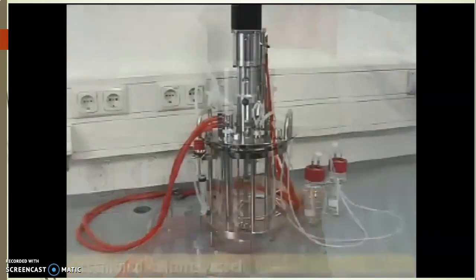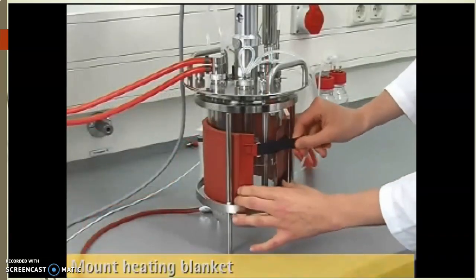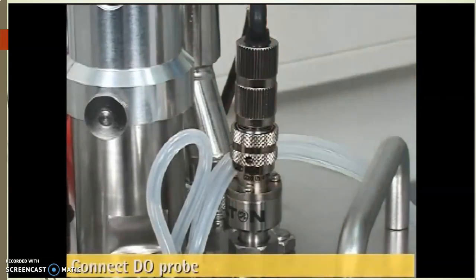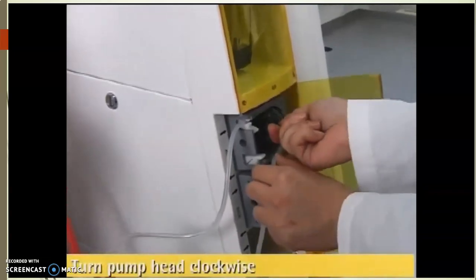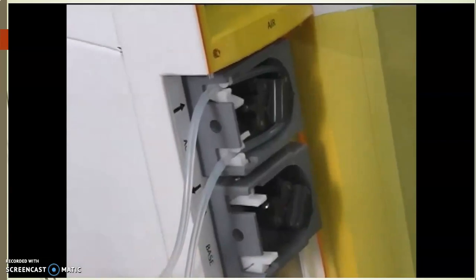Now installing the agitation motor, then this is the culture, then the heating blanket. After this the pH probe is getting connected, DO probe is also getting connected. Now the tubings to the motors are being set. It should be set clockwise.